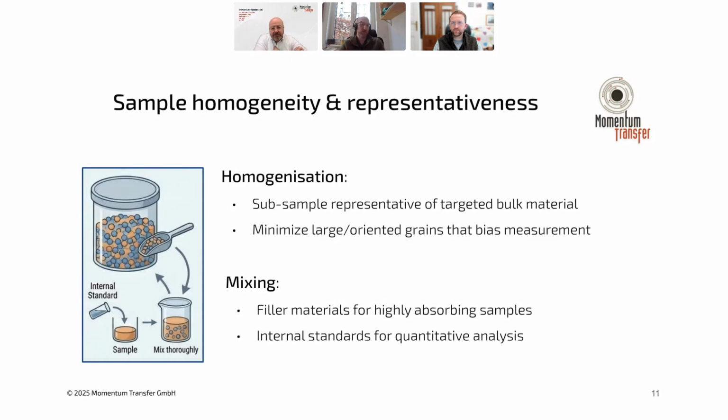In regards to fillers for absorption, to sort of deal with that, we choose to actually run all of our measurements, even the high resolution ones, at high energy. So then the absorption issues tend to be less of an issue. Of course, you may still be working with some very heavy metal material, and then it might be still something important to consider.